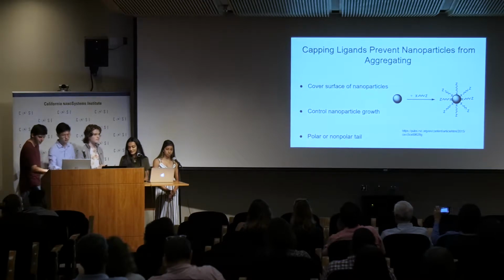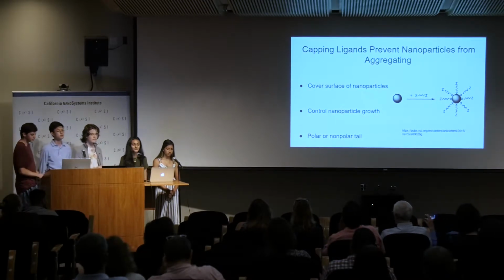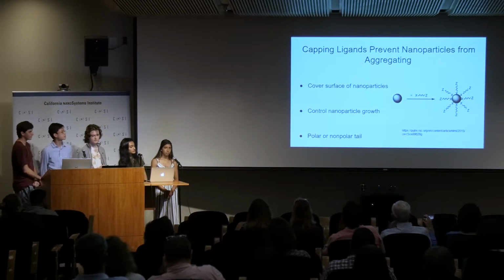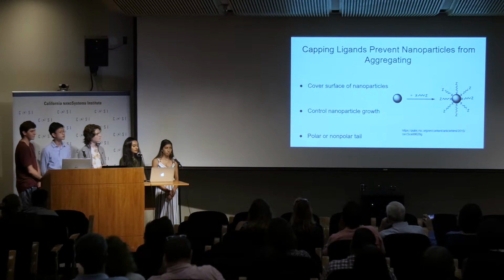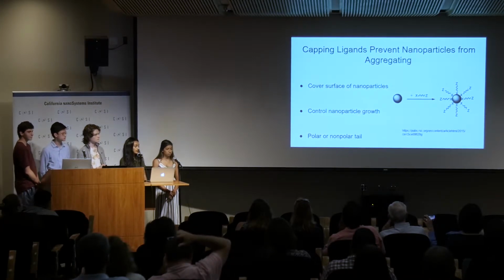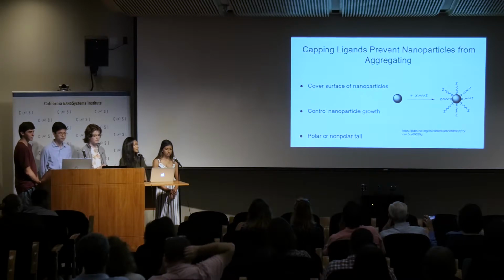As Brandon said, these nanoparticles are super, super small. So what we have to do is cap them in order to preserve their nanoparticle properties. To do this, we use a capping ligand that is either polar or nonpolar in order to control the nanoparticle growth.